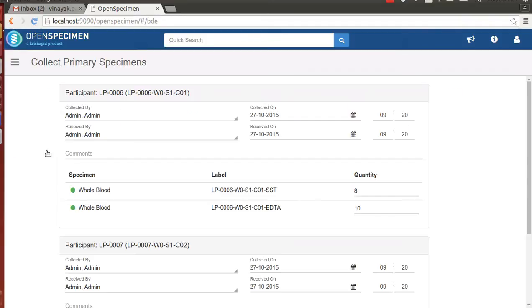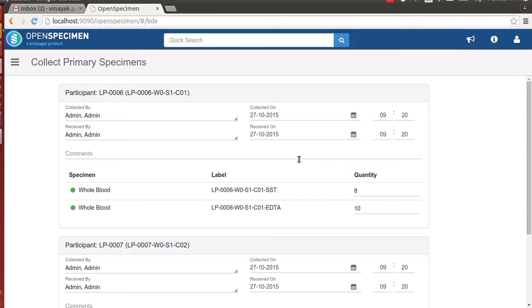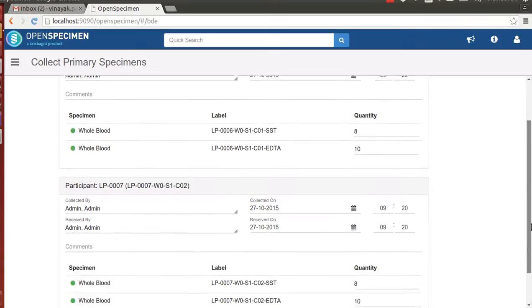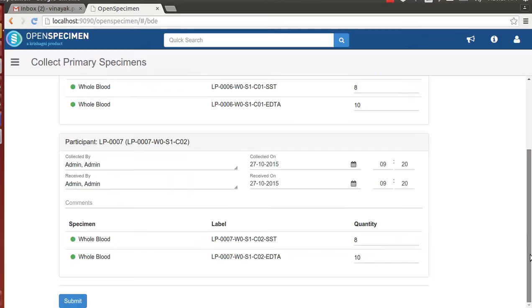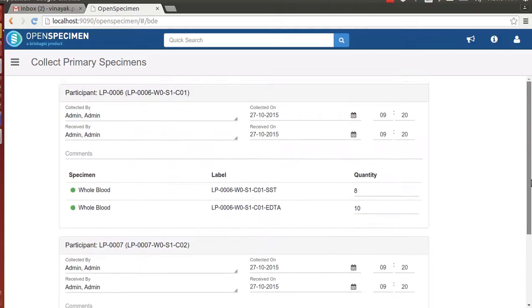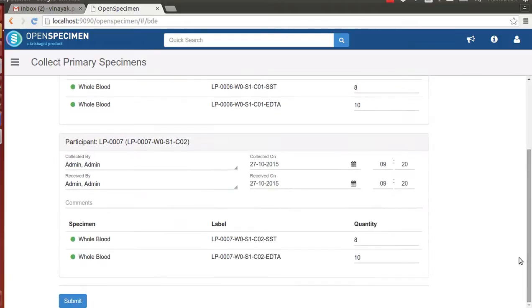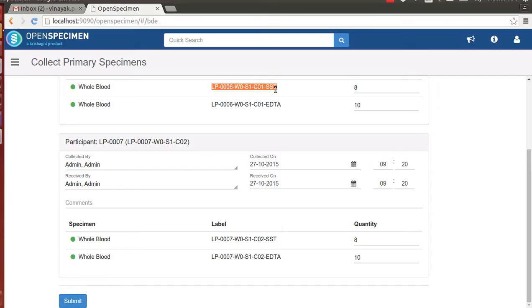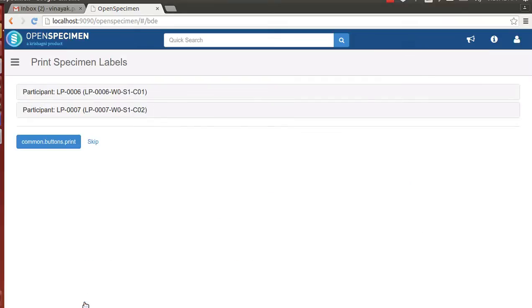On the next screen, there is a card for each visit. Each of these cards presents the primary specimens that will be collected. Since our visit had two primary specimens, there are two entries appearing in each of these cards. Let's review and proceed to further steps. At this step, the primary specimens are collected.